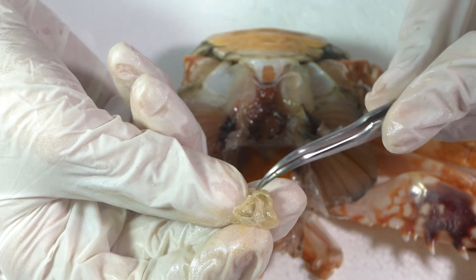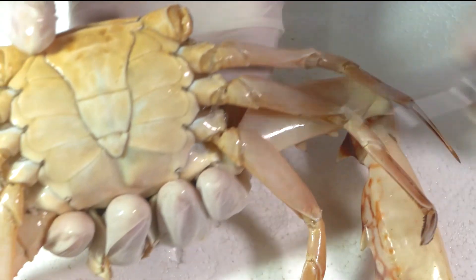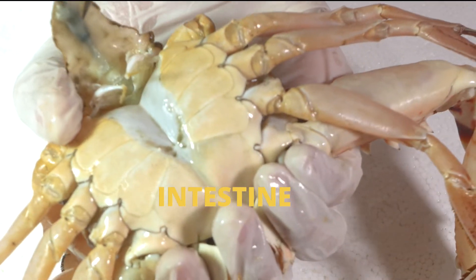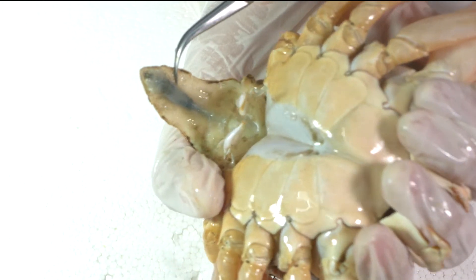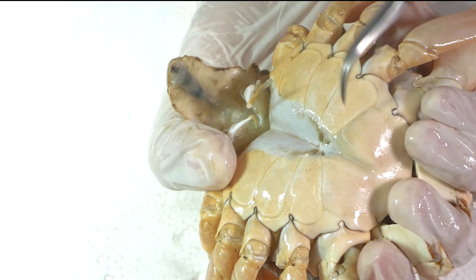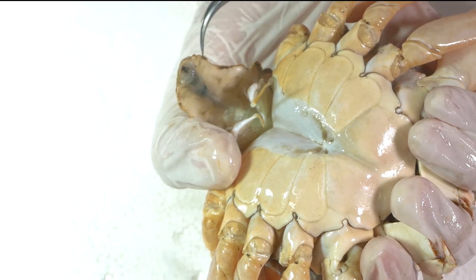Coming off from the posterior end of the stomach is the intestine, which runs ventral to the heart, comes to a point, turns the corner, and then goes out to the abdomen where the anus is located.